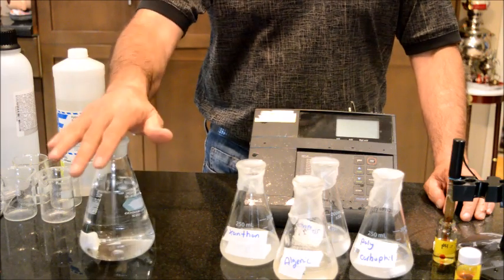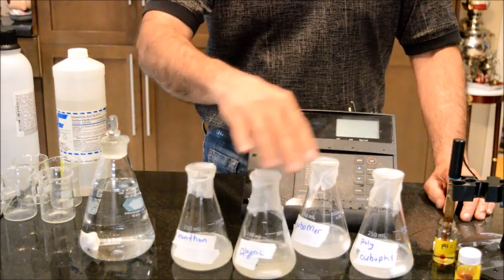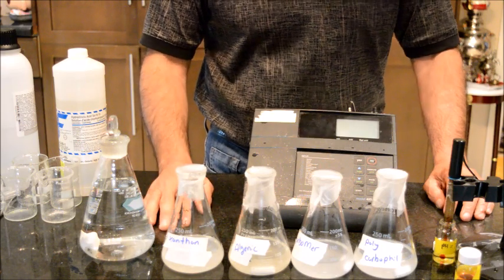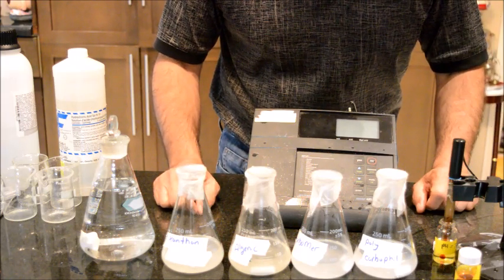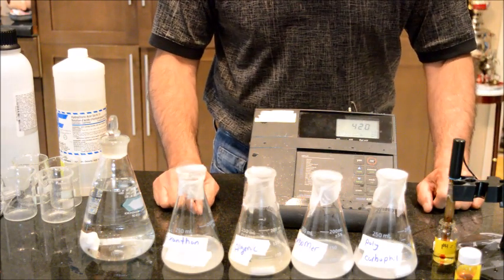Now, because the simulated fluid is 4.2, I'm going to adjust the pH of my gelling solution to be similar to the vaginal fluid. So I'm going to turn on the pH meter that I have here, and it is already calibrated.